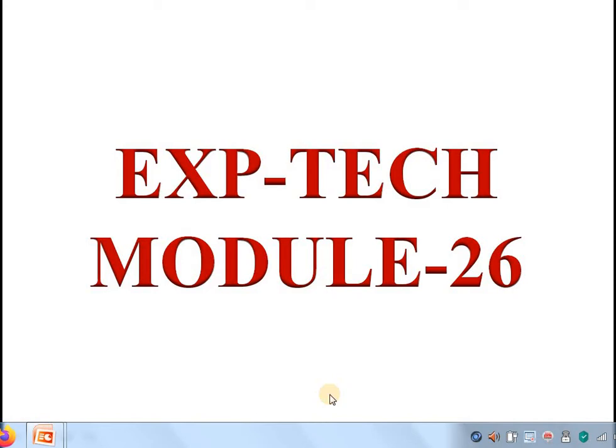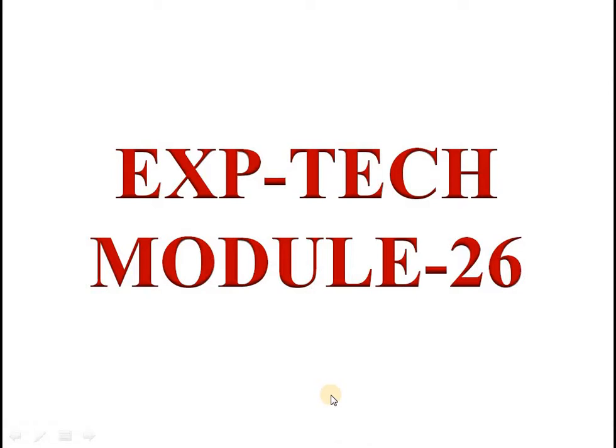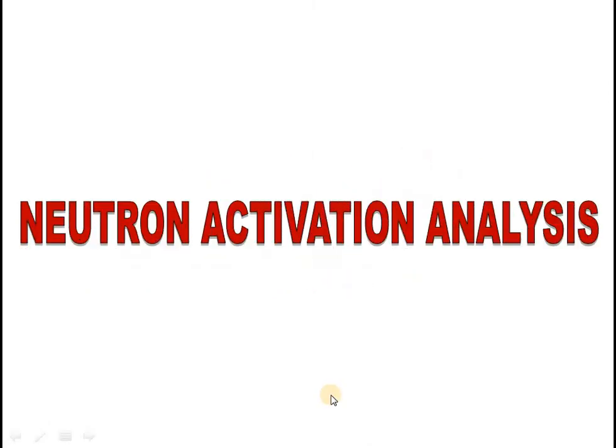Hello, good morning, students. So, today we will continue with the elemental analysis technique. In the previous class we discussed in detail proton-induced X-ray emission spectroscopy. This time we will come across another important technique used in elemental analysis, and that is neutron activation analysis.